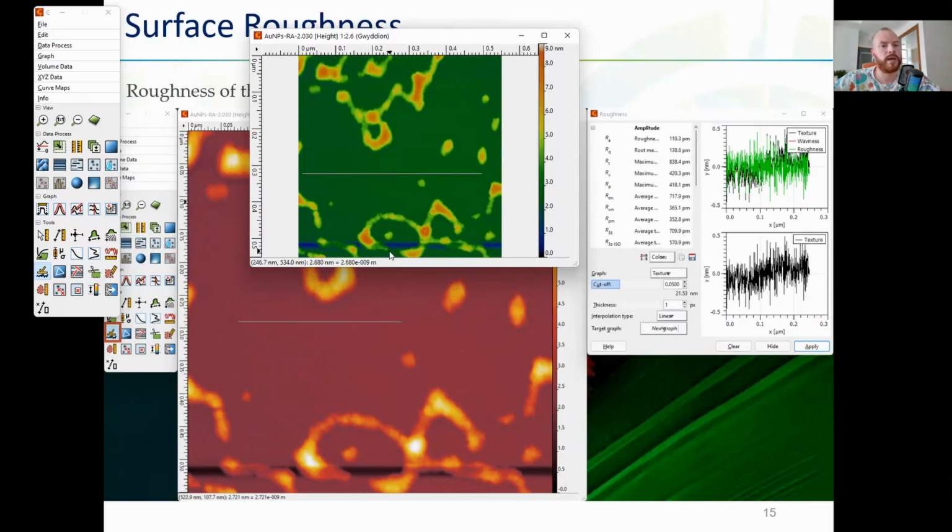And then you understand very easily that there is a trench, but as I said, this trench comes from some mathematical treatment of the data. And this trench here is at very low Z, but the rest of the sample is located around here, around 2 or 3 and so on.